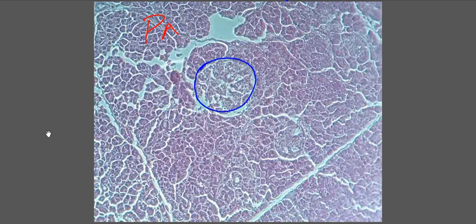Now, group 2, you guys want to tell me what that thing is that I surrounded with the blue? I'm gonna ask group 2 right now. What is this thing that is encircled by blue? Hmm? No.